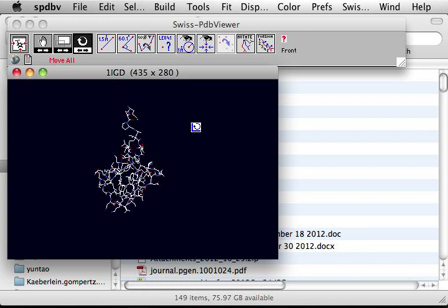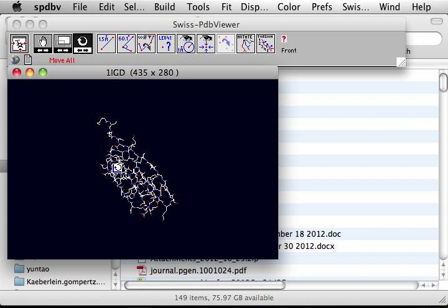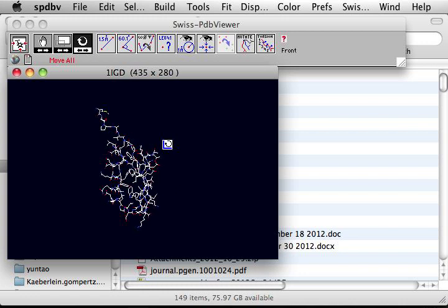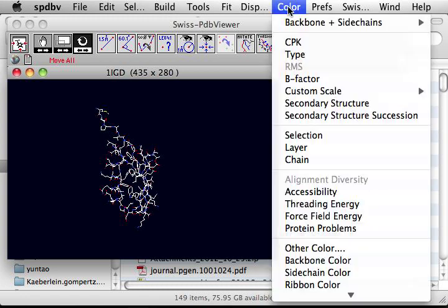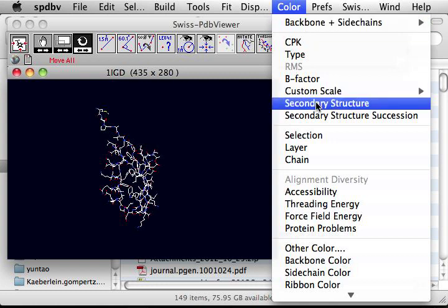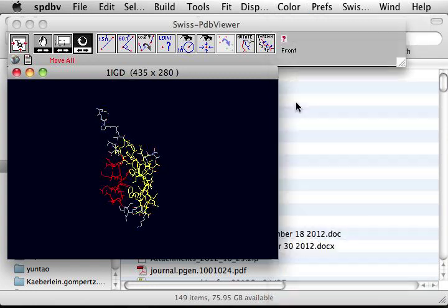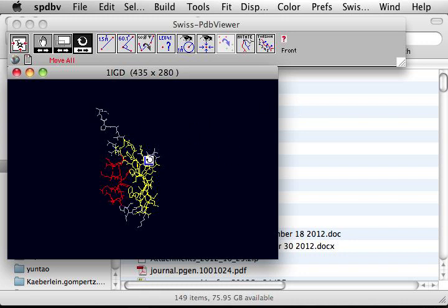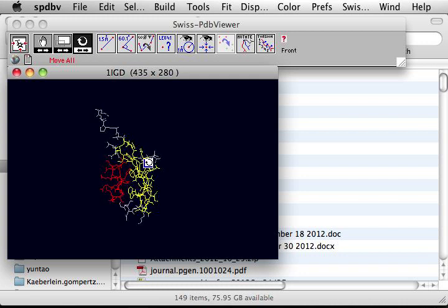Now, we can try to do some simple manipulation of protein structure to make the views much nicer. So one way is to use the color function. That's on the menu. So color, and then let's try. There are various ways to color it. So let's try by coloring by secondary structure. In this case, by default, the red is alpha helix and yellow is beta sheet.